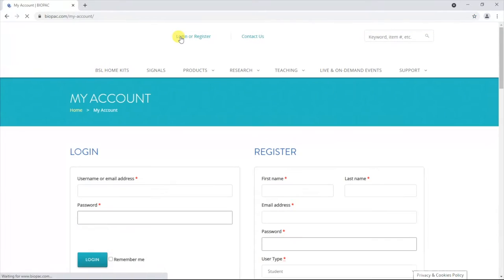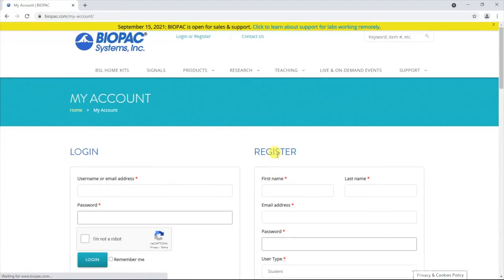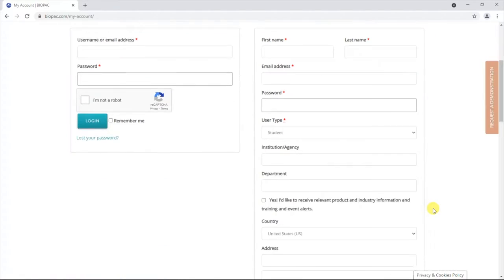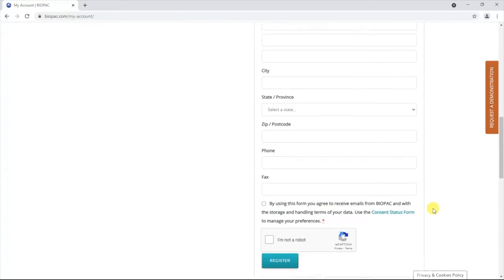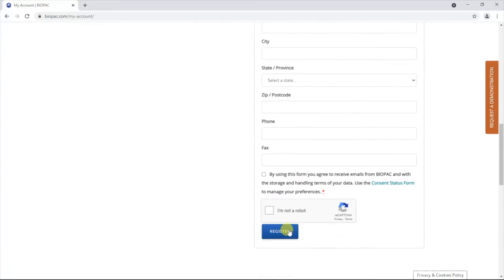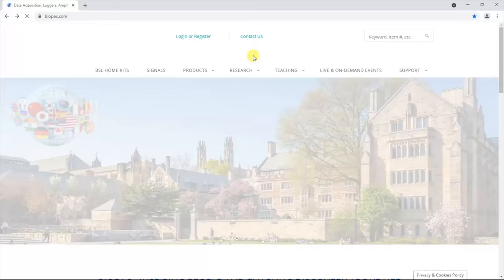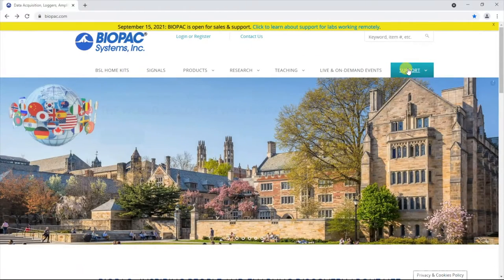In the window that opens, fill in the fields on the right of the screen under Register, typing in your name and email address along with the MC Edison campus mailing address. Once you click Register, the screen will return to the Biopac home page.